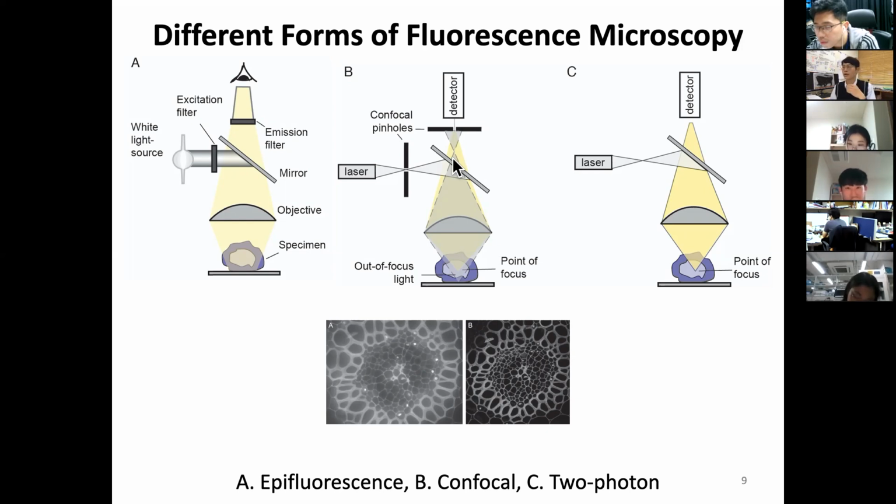Okay. Why I want to describe this is because a typical microscope has light coming from above, below, everywhere. So that's why we have a blurry haze background here. So let's say I'm using a laser and I send the light in a very precise way, like this.